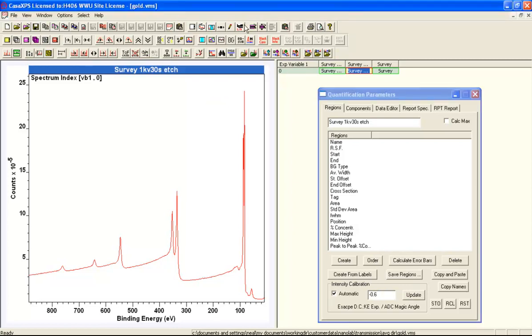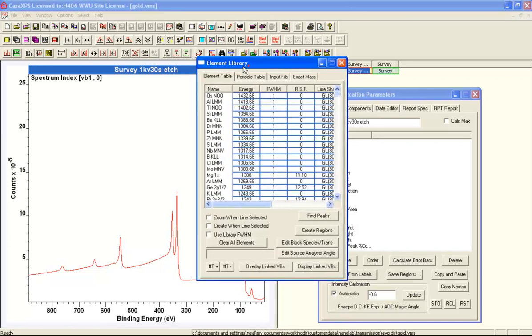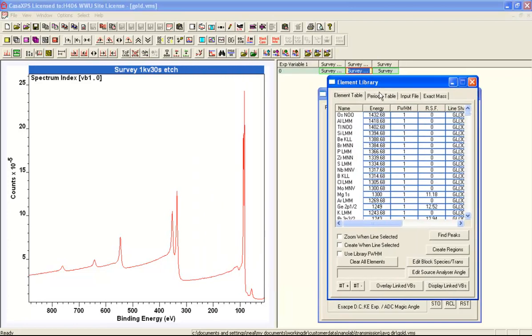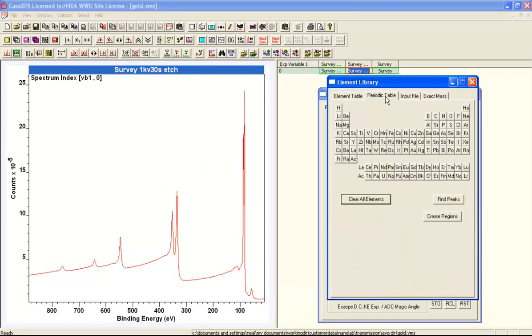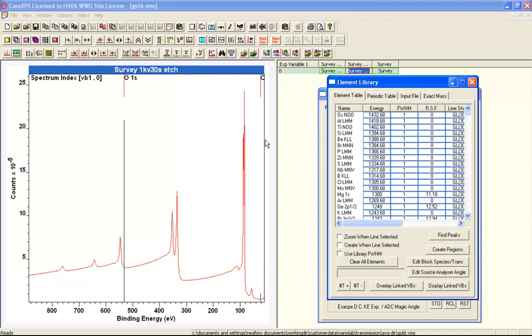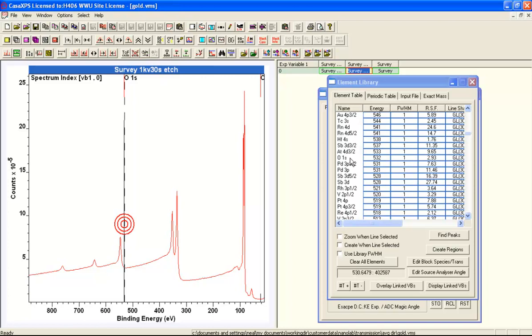We need to verify that our library is currently displaying Schofield cross sections. If I indicate oxygen and then click on oxygen, I can see that I've got 2.93, and that's the Schofield cross section for aluminium for oxygen 1S. So I know I've got a Schofield library loaded.